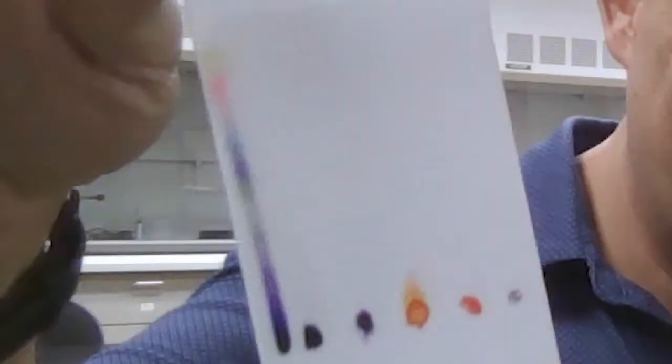Okay, I let this run for over an hour. It took forever, but here is the final result. That first little spot here, where we see all the different colors, was the black Sharpie. I'm trying to see the different pigments inside the Sharpie. You didn't think black had all the colors in it, but it does. Some of the other ones didn't really move all that much. The highlighter moved a little bit. But we're noticing that the wax pencil and the regular pencil did not move at all.